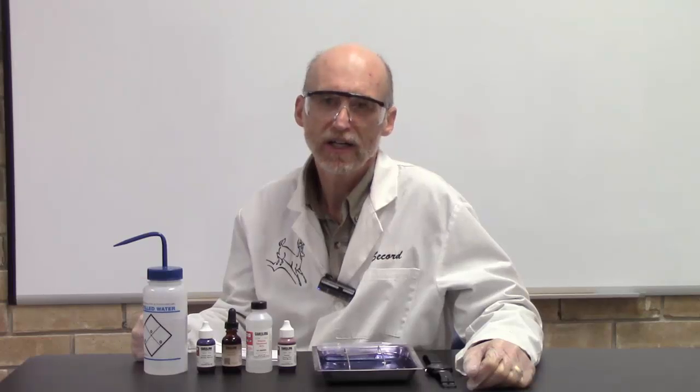In this video we're going to look at the gram stain technique. The purpose of the gram stain technique is to differentiate between bacteria that have a thick cell wall and those that have a thin cell wall. It's a diagnostic step we use when trying to identify an unknown bacterium.